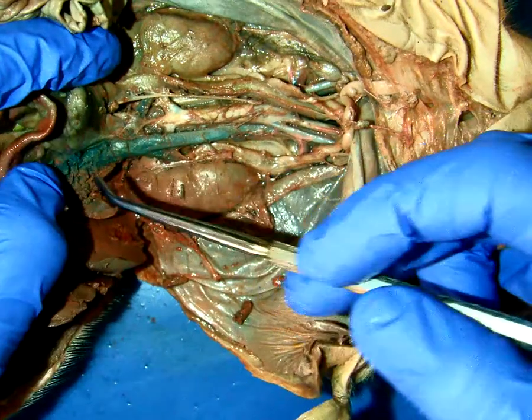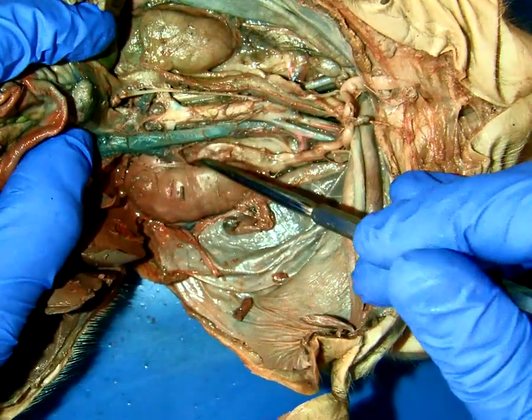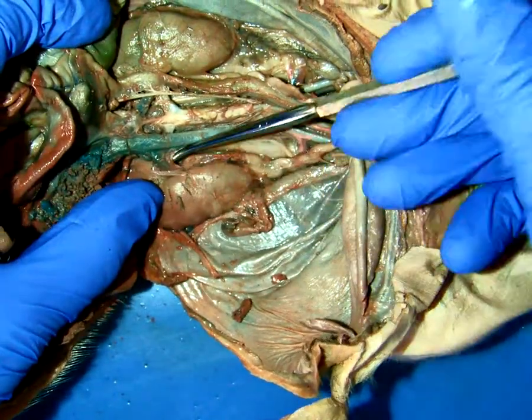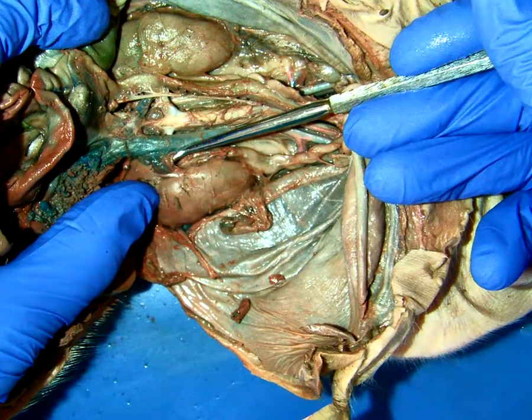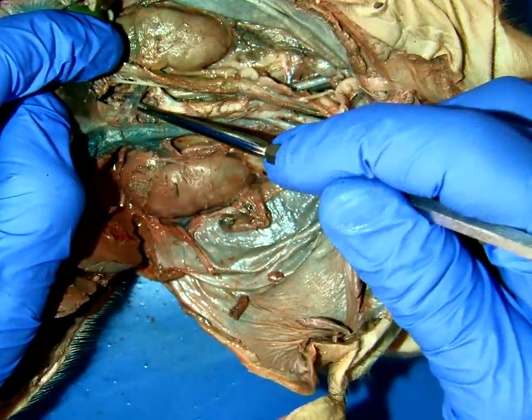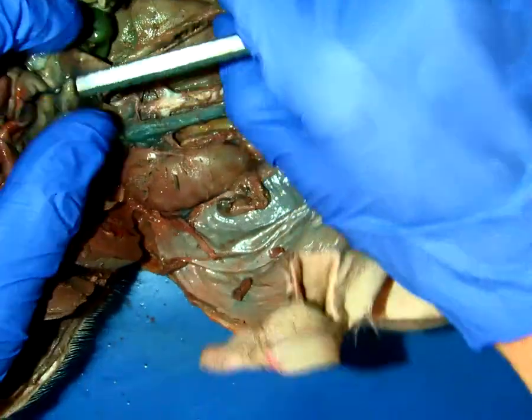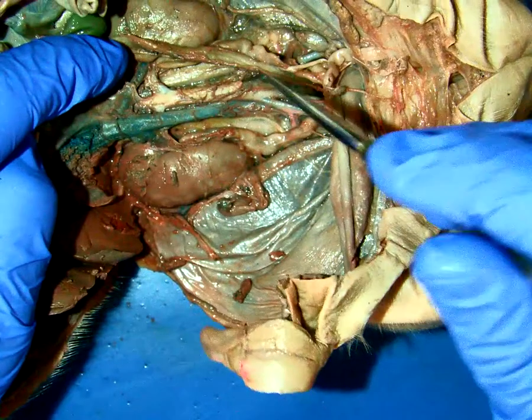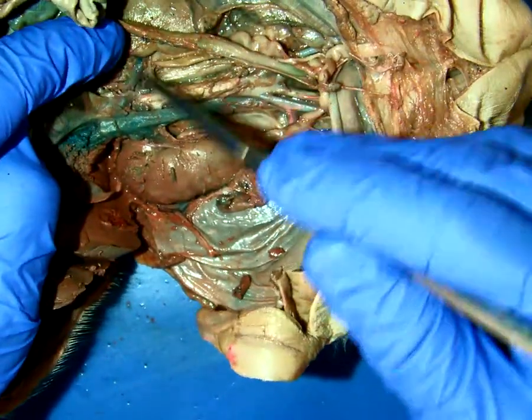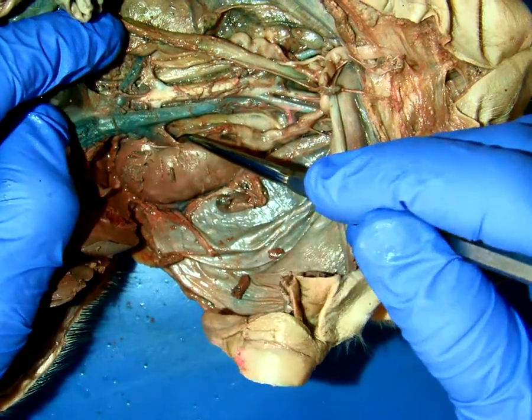So I don't require students to know in the viscera because we want to keep all that intact for when we study digestive. But I can certainly pick out the right renal vein and the left renal vein over here. I can see them moving into the kidneys, and I don't want to destroy the intestine, so I'm kind of pushing that aside. All right. So left renal vein, right renal vein.